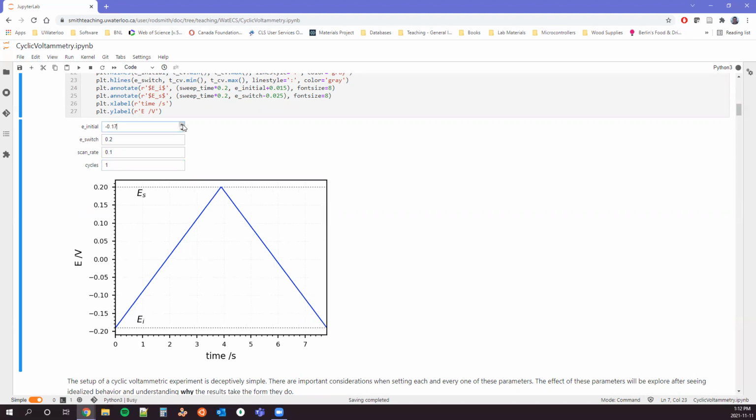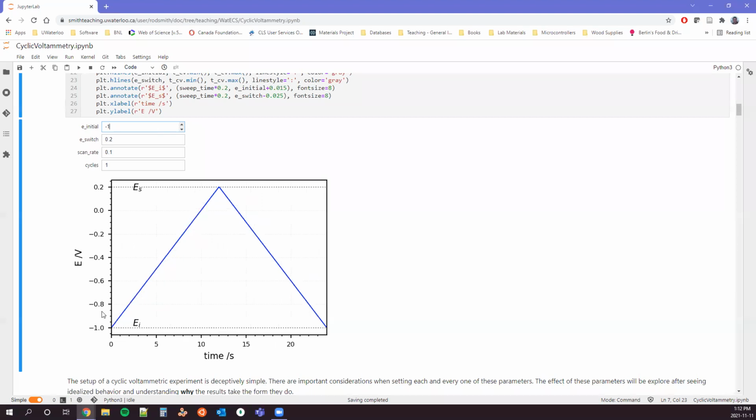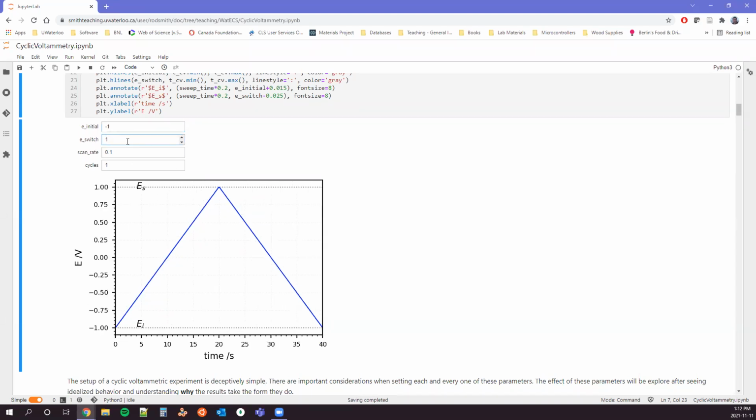And so we can play with these values, we can decrease them, we can increase them, right? And we can go to negative, we can start at negative 1 volt, we're just changing where we start. We could do the same the other way, right? And so we can change exactly how far we want to go. This effectively sets the window in which we want to look.